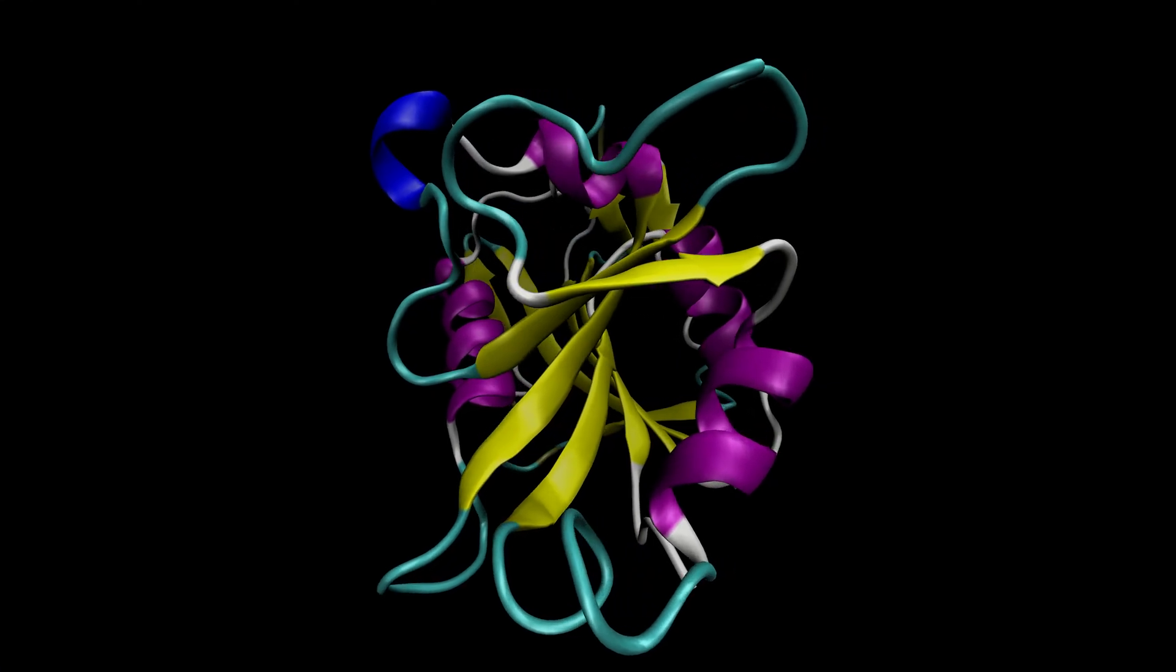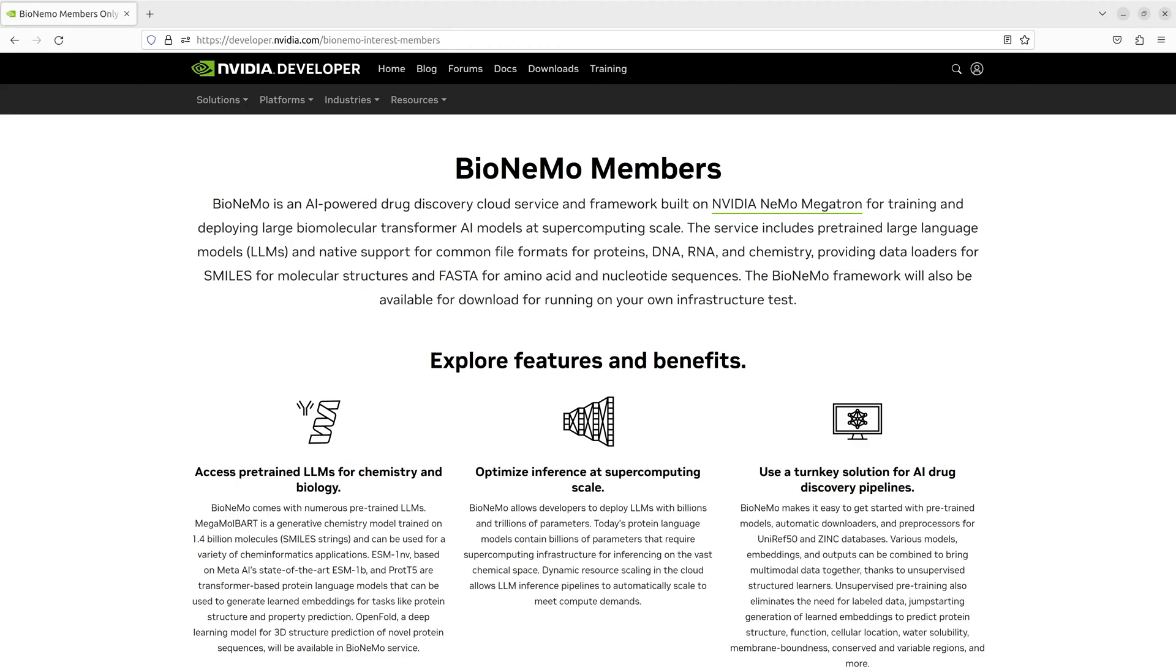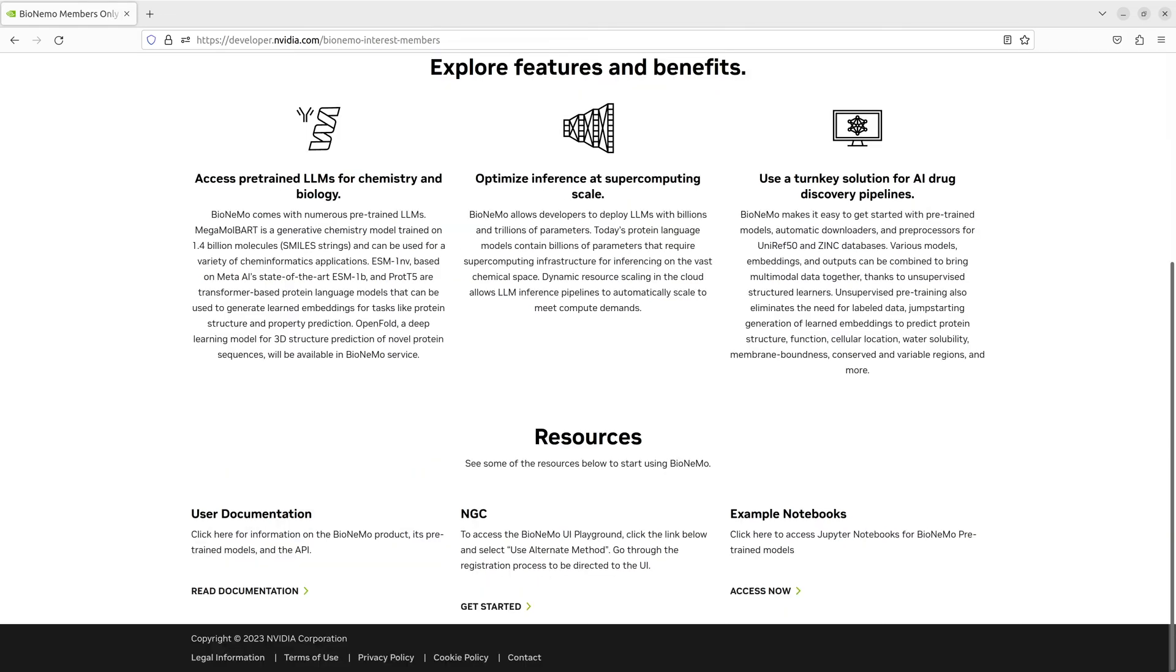NVIDIA Bionemo includes an integrated UI and a standalone API that provides seamless access to models and tools that can be used to quickly build custom workflows and drug discovery pipelines.